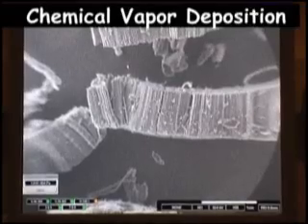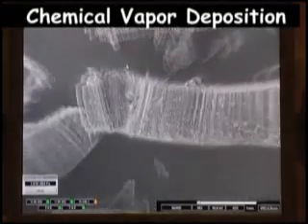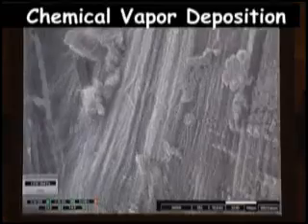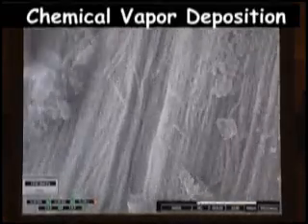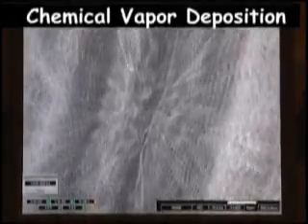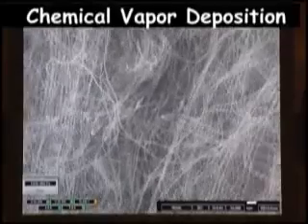This is the CVD sample at a lower magnification, but let's go to the highest possible magnification of the SEM. Now we can see the individual tubes.